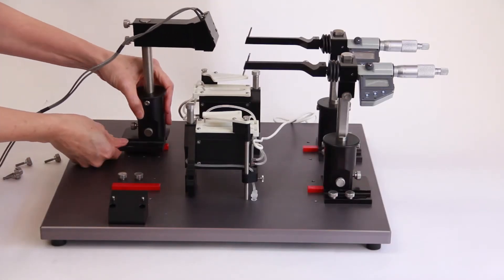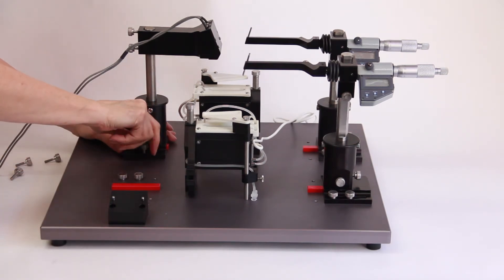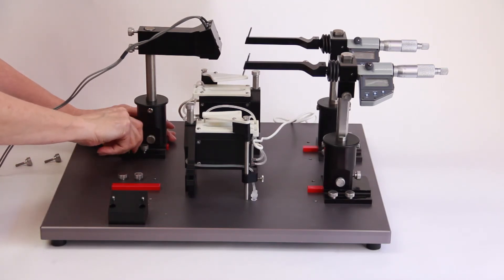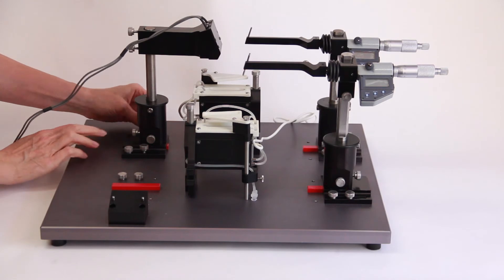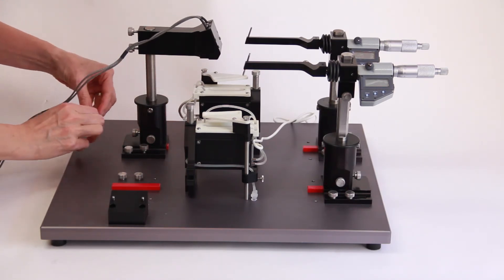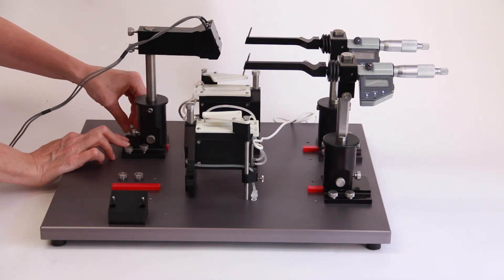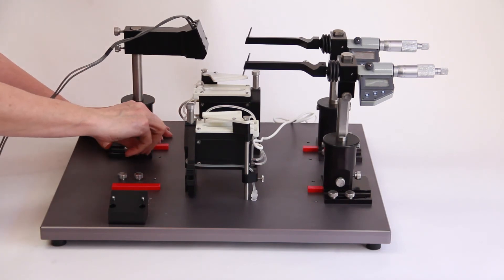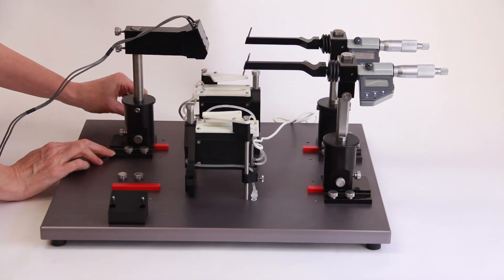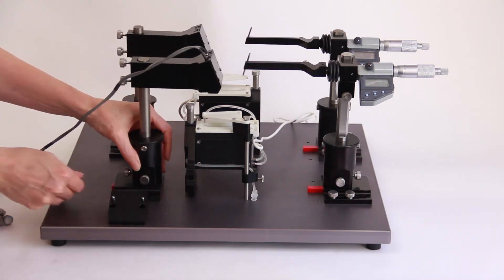Position the assembled force transducer stands on the left side of the base plate so that the mounting slots on the stand align with the holes in the base plate. The force transducer mount must face the cuvette. Insert four thumb screws through the mounting slots of the stand and into the four holes on the left side of the base plate. Slide the force transducer mount into the position you prefer and finger tighten the screws. Install the second force transducer stand using the same method.